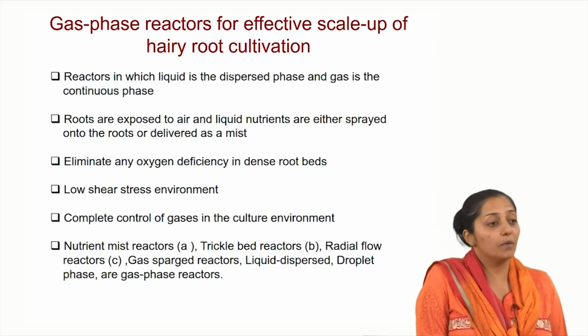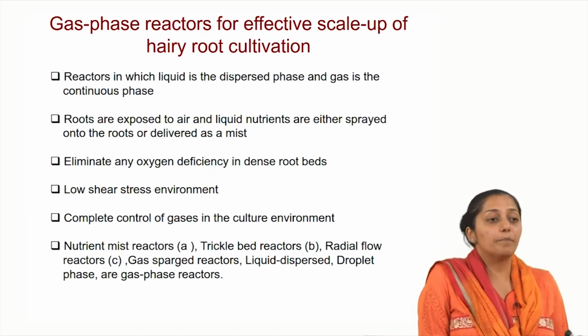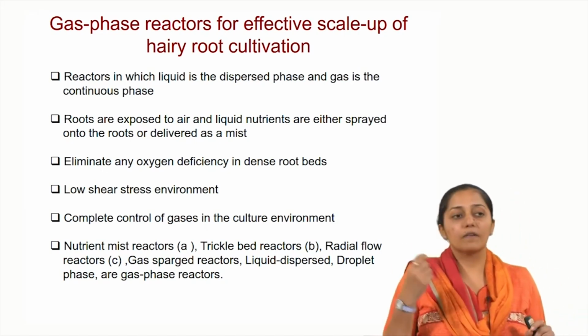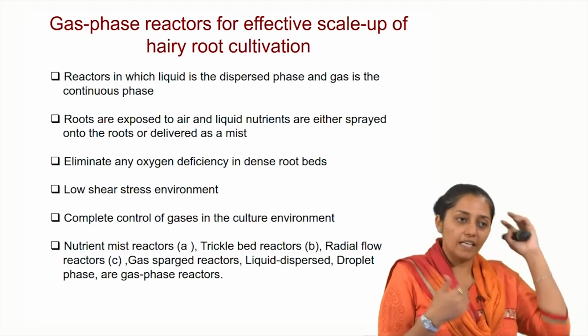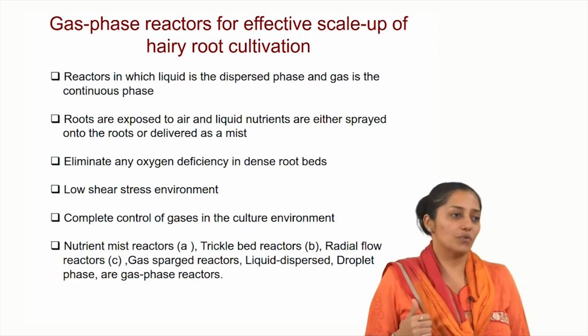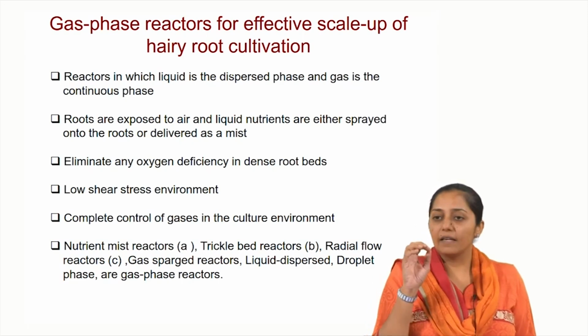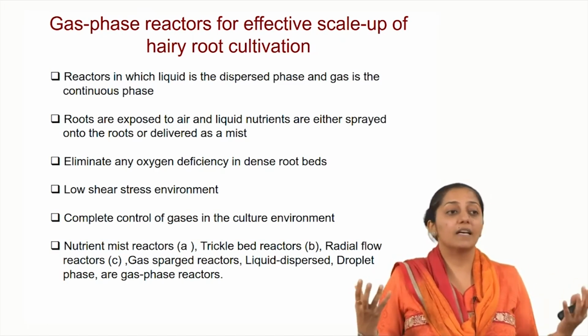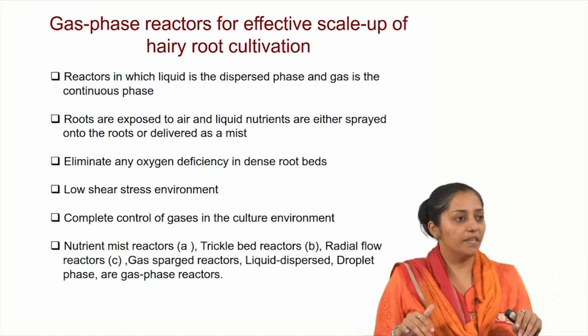Hydrodynamic stress could be avoided, as well as hyperhydricity. Roots, when completely submerged in the liquid medium, we also observed a lot of mucilage getting collected onto the root surfaces, which was inhibiting the growth of the roots. Availability of nutrients also does not mean that you keep it submerged in the liquid medium.